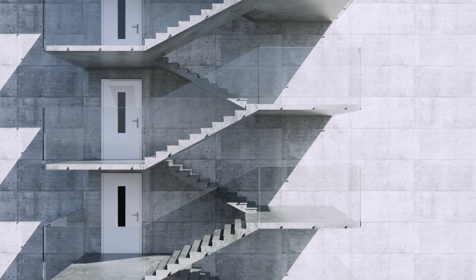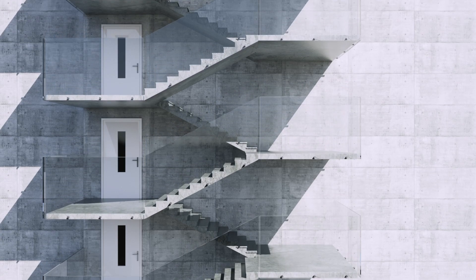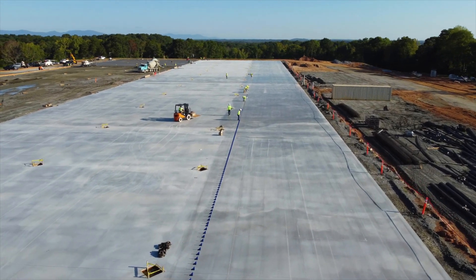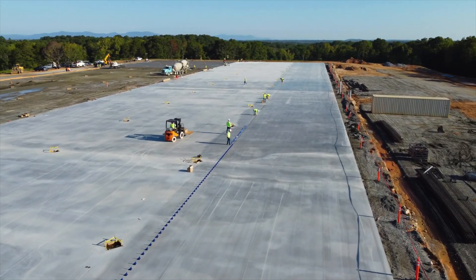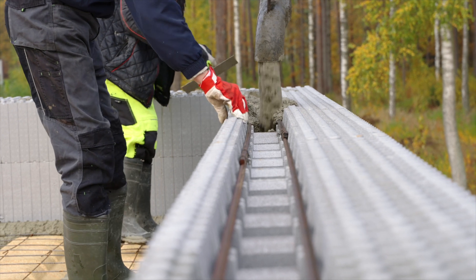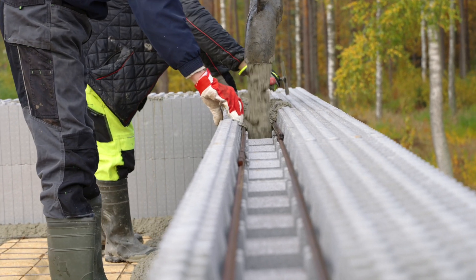With increasing demands for safety and longevity in structures, it's essential to ensure that cement meets all required standards. Poor quality cement can lead to serious issues like cracks, structural settlement and even accidents. That's why accurate cement analysis isn't just a formality – it's a necessary step to ensure the reliability of every construction project.